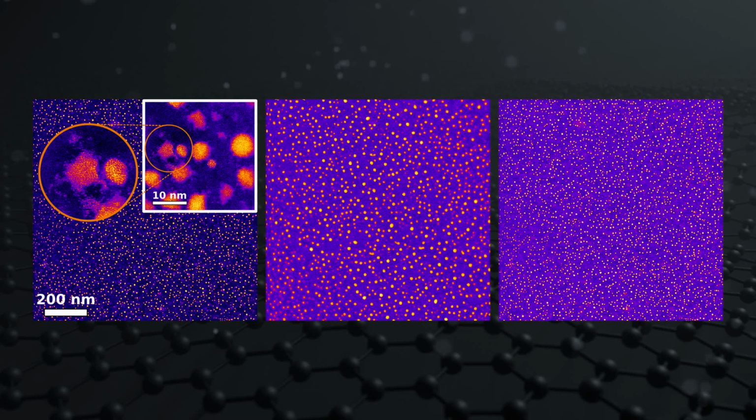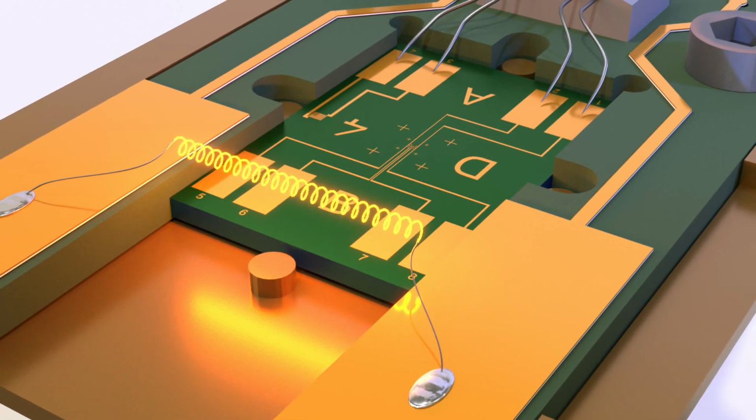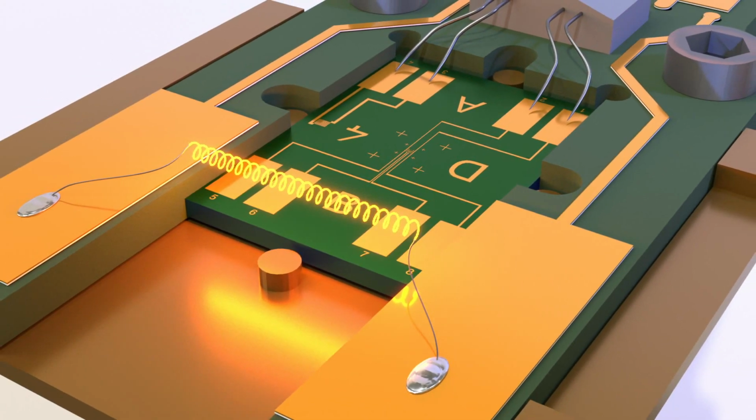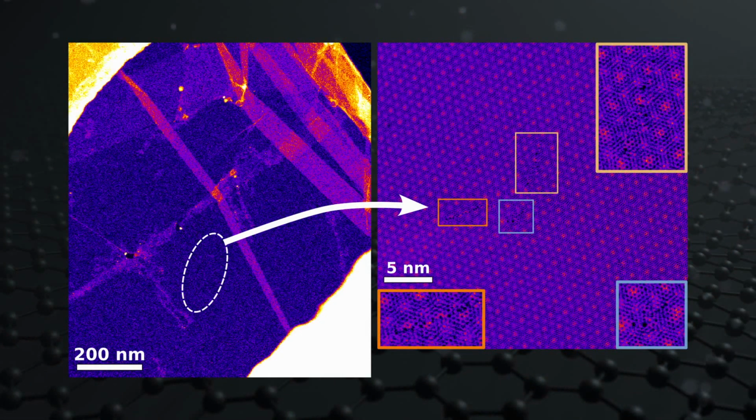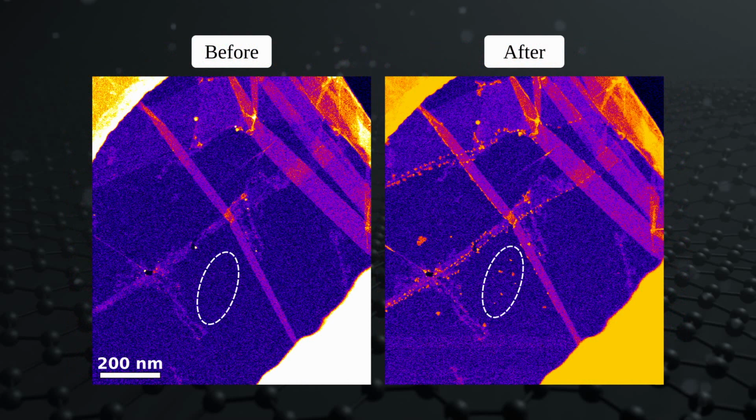We are primarily interested in the ability to deliver single atoms, so while getting nanoparticles is a great initial step, showing that we can thermally deliver material, we would like to deliver a smaller amount and from a pure source, not solder. To this end, we coated another filament with 500 nanometers of tin and switched to a twisted bilayer graphene substrate. We first heated the graphene to clean it and then held it at 500 degrees Celsius. As well, we damaged a few locations with the electron beam, shown here. Then we activated the filament to thermally deliver the tin.